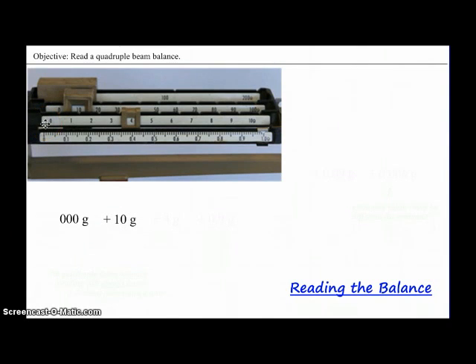The rider that's in front of that, the 1 gram rider, you can see that it is boxed around the 4, so that gives us a reading of 4 grams. Now the beam at the very front of you, the one closest to you, doesn't have a brown box like that of the other riders. It has a little silver rider, which is down here. And when we look at that, we see that it is pointing after the 0.9, but before the 1.0 gram markings, so we're going to go back to the one previous to it, and we're going to say that it represents 0.9 grams.